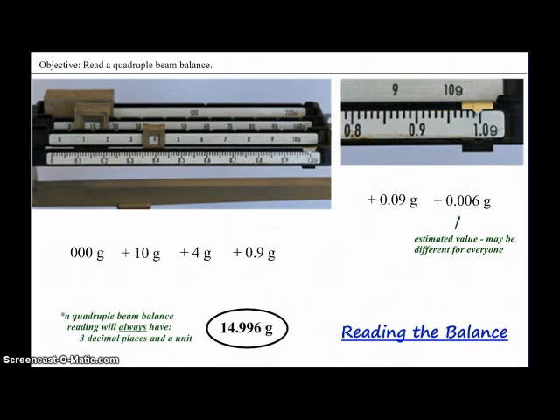Remember, a quadruple beam balance reading will always have 3 decimal places and a unit of grams. Even if the last number is a 0, you have to write the 0 down. You always need to have 3 decimal places in your reading.